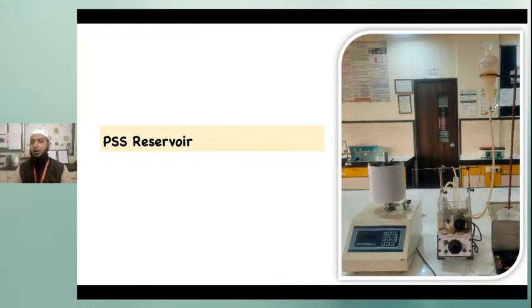And here the stopper is given. With the help of this stopper, when you open it, there will be flow of physiological salt solution from this reservoir into the internal tissue organ bath, because every time you need to give washing to the tissue. Whenever you are giving the washing, the existing physiological salt solution which was in contact with the tissue, you are removing or discarding.